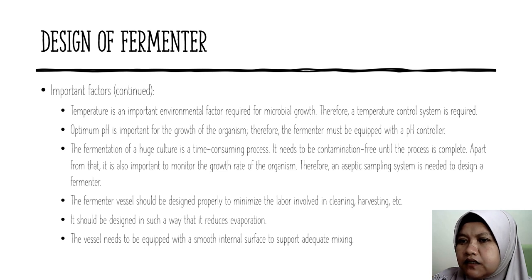The fermentation of a huge culture is a time-consuming process. It needs to be contamination-free until the process is complete. Apart from that, it is also important to monitor the growth rate of organisms. Therefore, an aseptic sampling system is needed to design a fermenter.